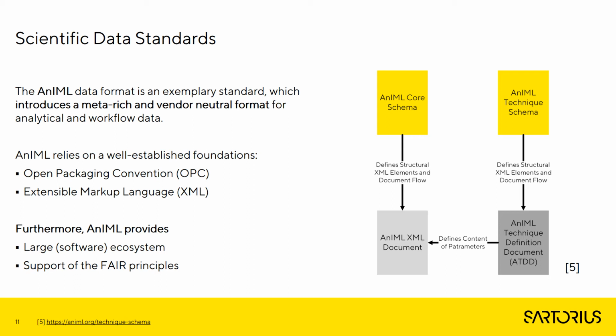Exemplarily, I want to give a very short introduction into the Analytical Information Markup Language. The AnIML data format is a scientific data standard which introduces a meta-rich and vendor-neutral format for storing analytical and workflow data. AnIML also relies on well-established technologies, which include the Open Packaging Convention and the Extensible Markup Language.